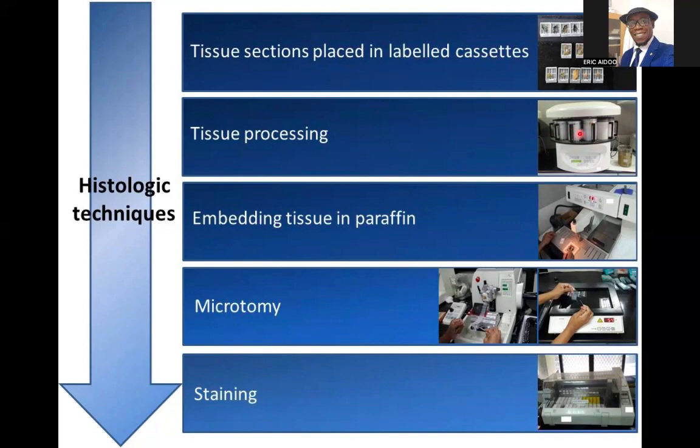So for instance, if you want the tissue to be in 60% alcohol for 1 minute, after the 1 minute, it will rotate and then take the tissue to the next stage of, let's say, 70%. Then after another duration that you have set, whether it's still a minute or 2 minutes or whatever, once that time elapses, the machine will rotate and then put the tissue in the next solution until it is done.